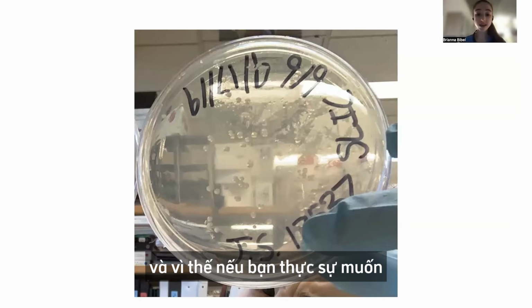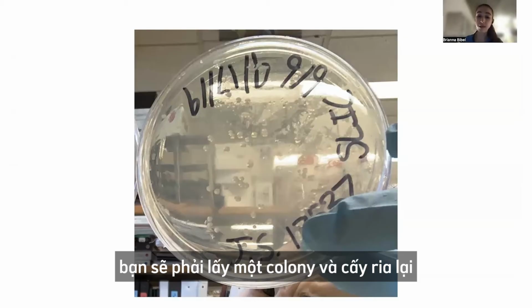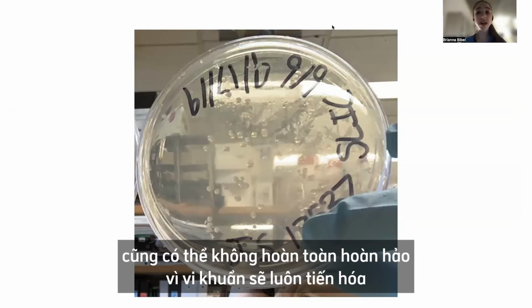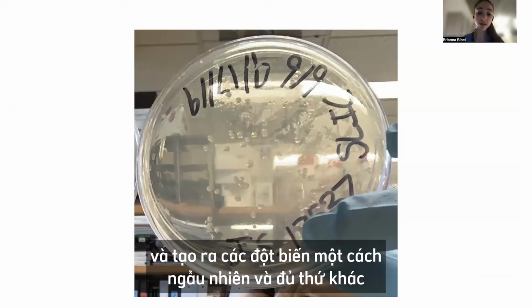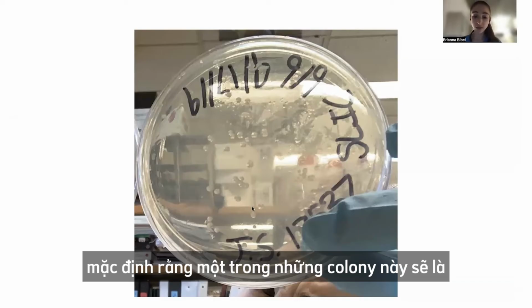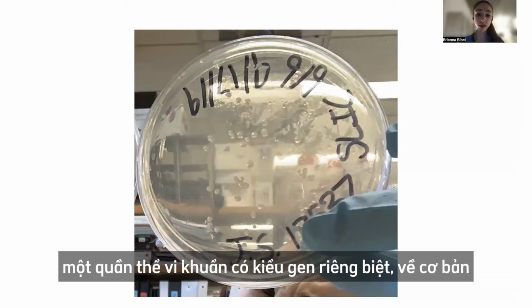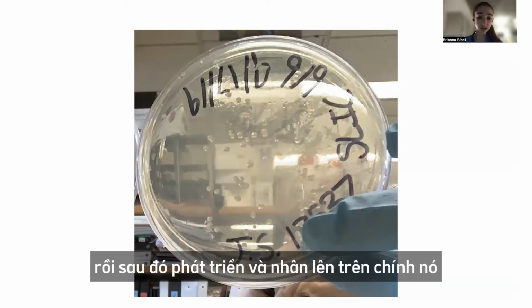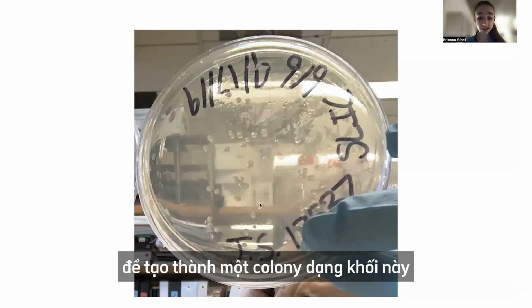If you really want a pure population, you'll have to take a colony and streak it, and then pick new colonies and so on. Even that might not be totally perfect, because bacteria are evolving and generating mutations randomly. But typically we just take it for granted that one of these colonies is a genetically unique population of bacteria. Basically, one of these bacteria takes root and then grows and multiplies on top of itself so that you get one of these loopy colonies.